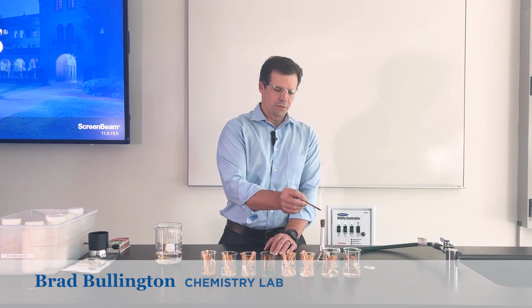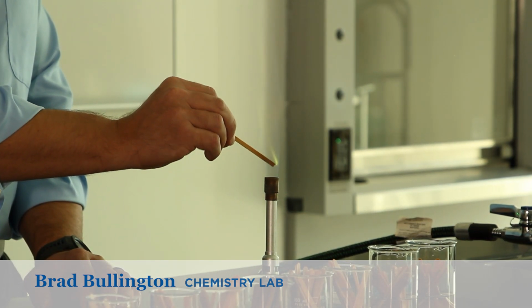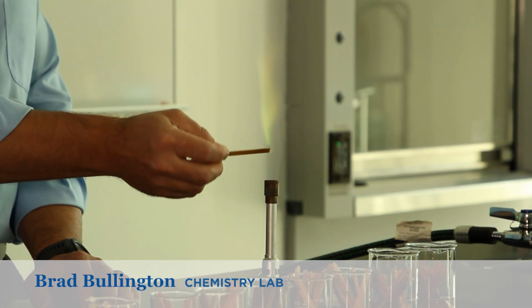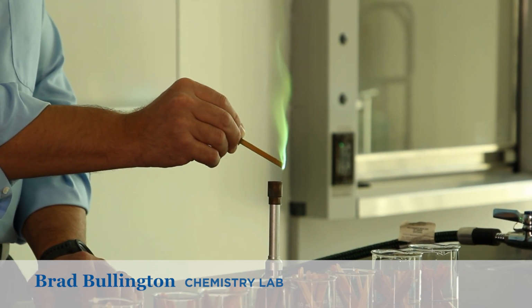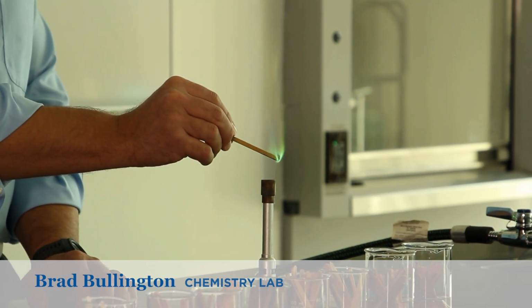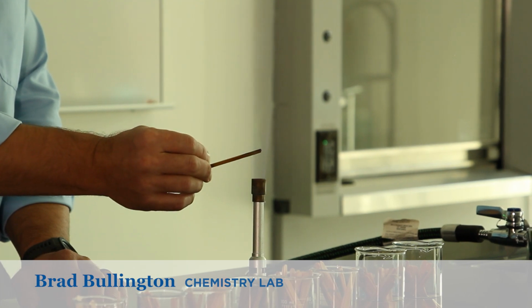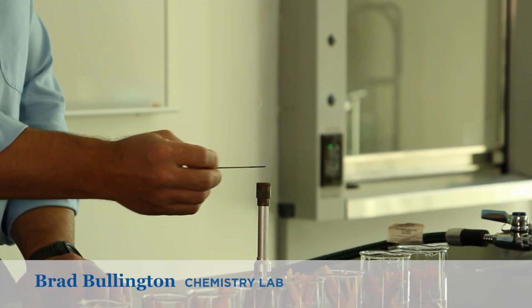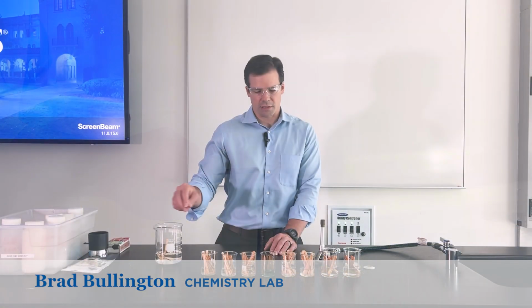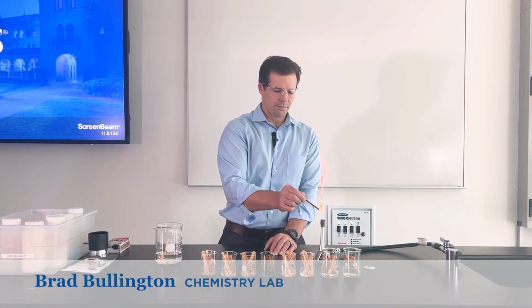Copper can emit really two colors. The first one that you see should be an emerald green. And then that may be followed up with a shade of blue or blue-green. Kind of looks like the patina that covers oxidized copper or the surface of a penny at the bottom of a wishing well. The next is sodium.